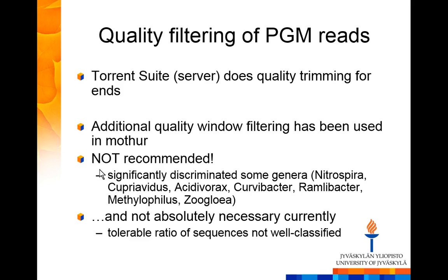So it starts to check from the end of the sequence for when the quality gets good enough, or acceptably good. And then it starts the actual sequence that it gives to you. If there are poorer quality regions, where it first goes up and then drops again, it still thinks it's an acceptable sequence. So poorer quality regions within the sequence, not at the end, those are an issue.